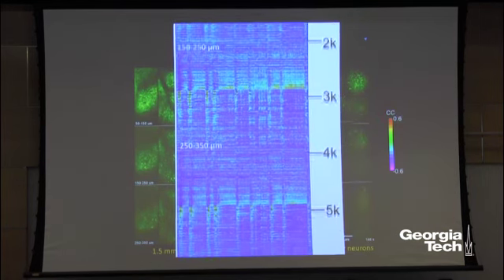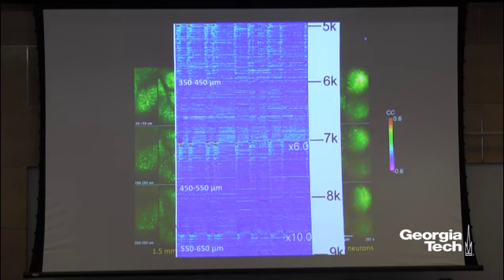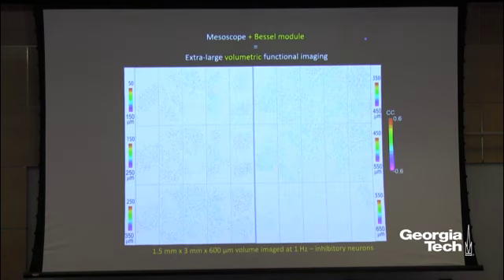And just to show you, we can record them all the way to layer 6 and find all those neurons. And we can color code each individual neuron by their correlation coefficient with the pupil diameter. And I'm not going to go into the detail of the biology because we only have n equals 1. This is what technology can do. You only need 1 example. With biology, you need to have a lot more animals. But just in this even single animal, you can see some differences in different cortical regions.